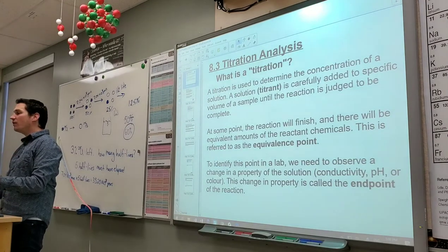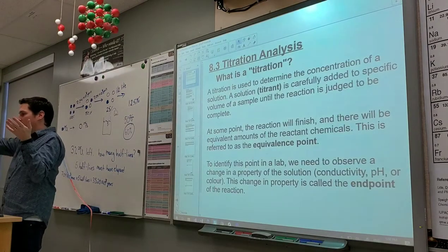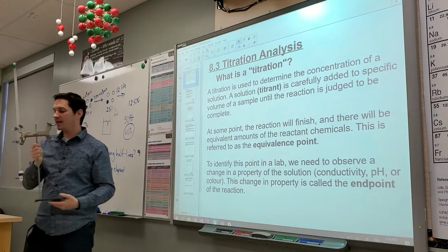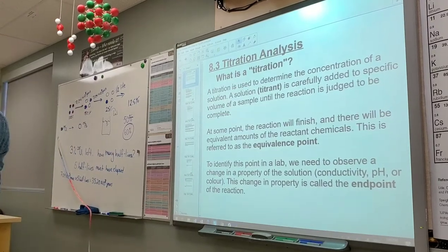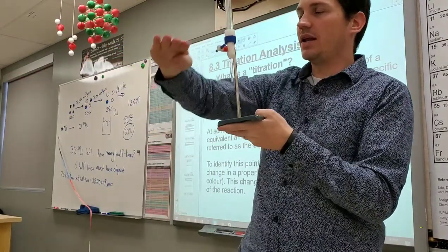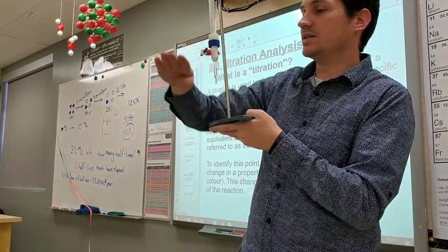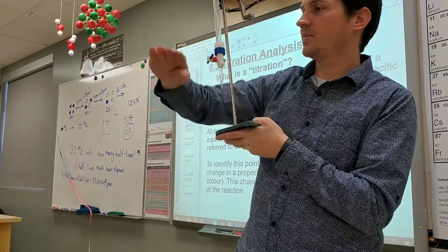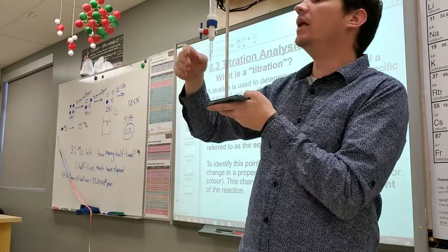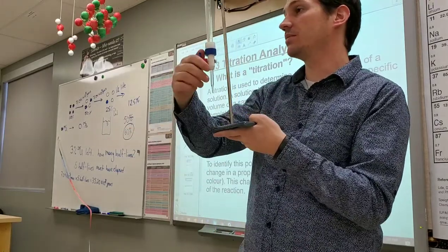The stopcock, the valve, is exactly like a faucet handle. What I want to be very clear about straight from the get-go is there's a little handle on the stopcock, and it's horizontal right now, so it's not parallel to the flow of the liquid. Does this mean open or closed? That means closed. If I turn it parallel, then that means open, and any liquid that's in here can start flowing through our stopcock into our sample.